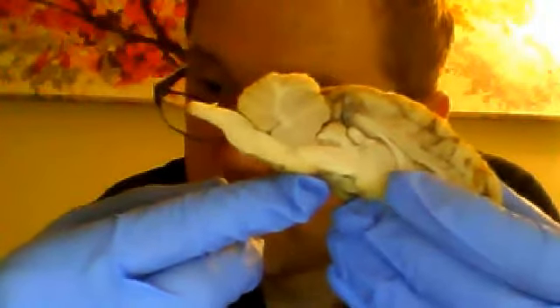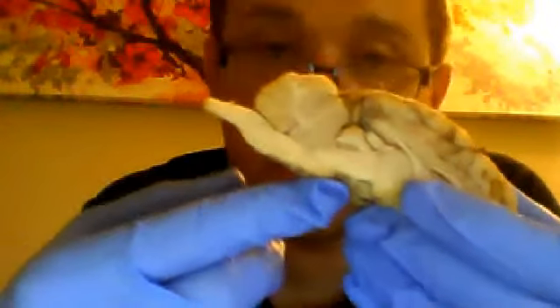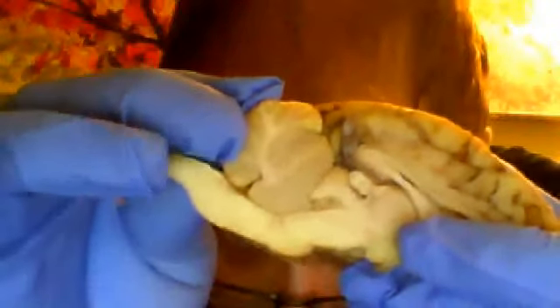And then from there, we're going to go to the fourth ventricle. Now, the fourth ventricle is actually located within the area of the cerebellum. So, if you look at the cerebellum here, I'm going to go ahead and bring it closer, and I'm going to pull it and tease it a little bit. Now, you see that area right there, that fissure there, that area is known as the fourth ventricle.